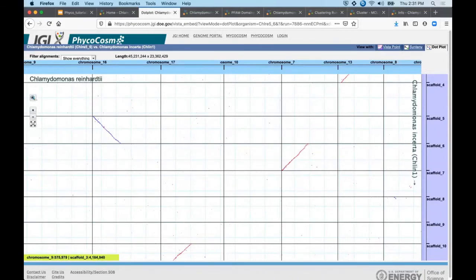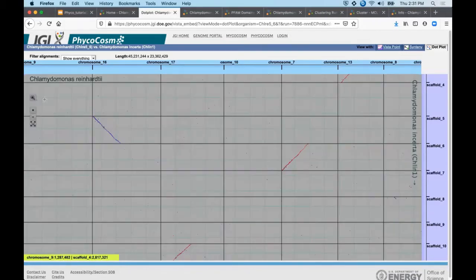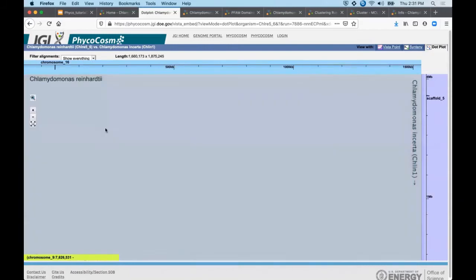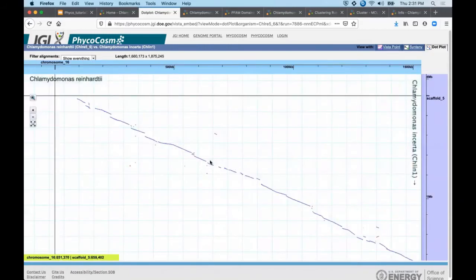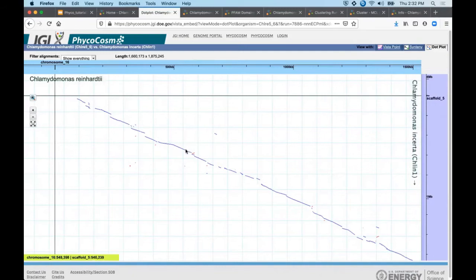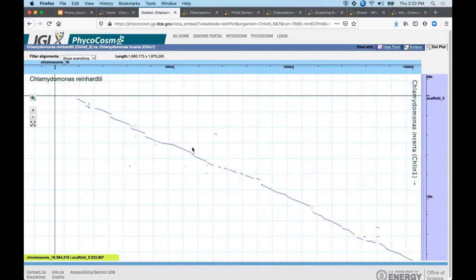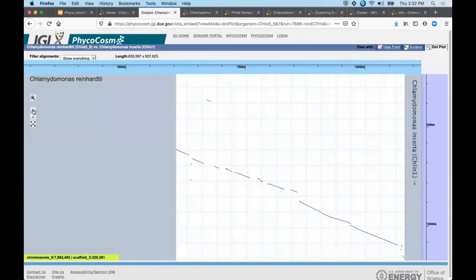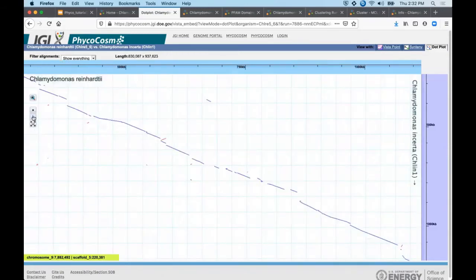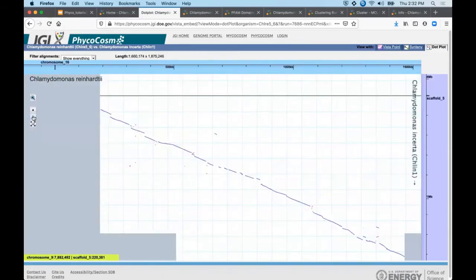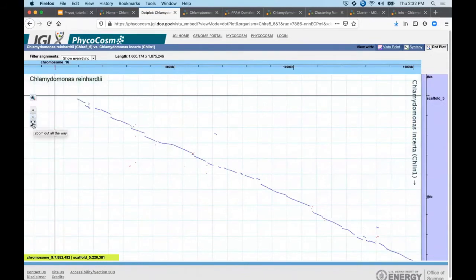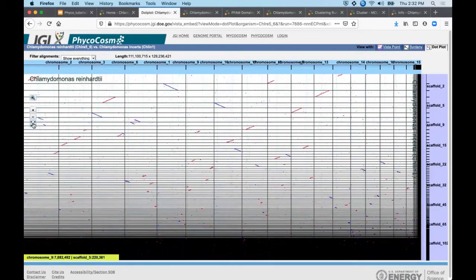These buttons on the left are additional navigational tools controlling the zoom level of the dot plot. For example, you can click and drag to zoom right in on a region of interest. You can move between particular zoom levels using these buttons or this final button here will zoom out entirely and display the full global alignment.